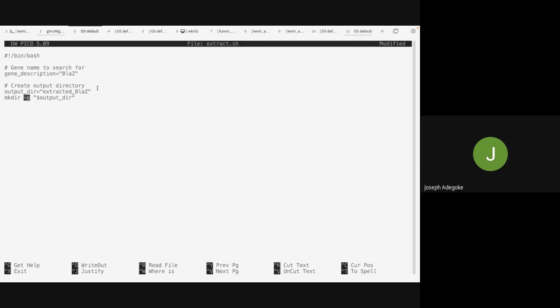But as you go on, you are going to be using some tools that will require you to create the output directory first before you run. And there are tools that, if you've created the output directory first, you will have to delete the output directory you've created, and then you just tell them to run it.